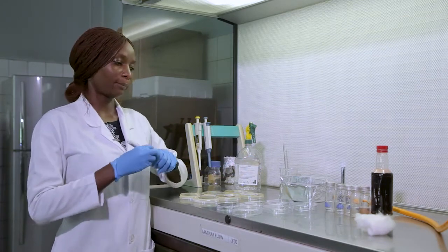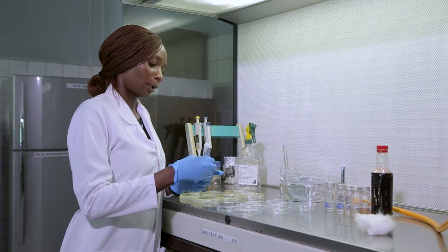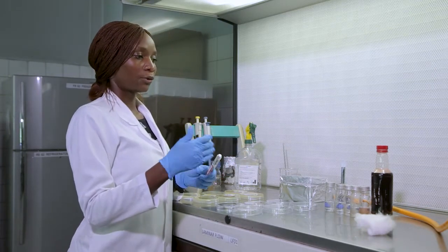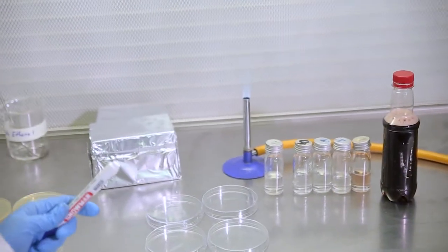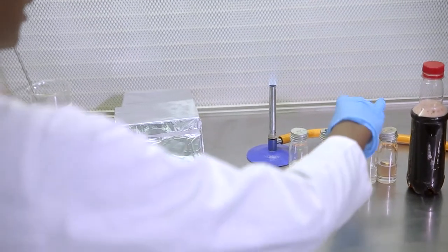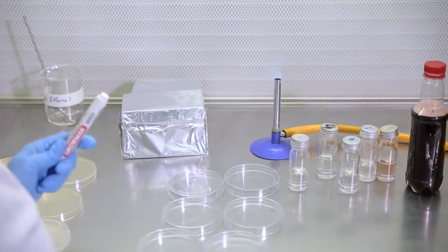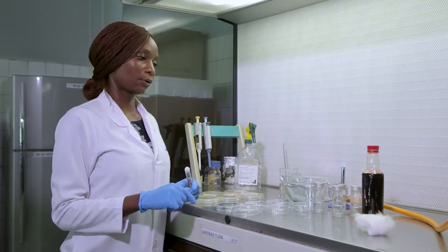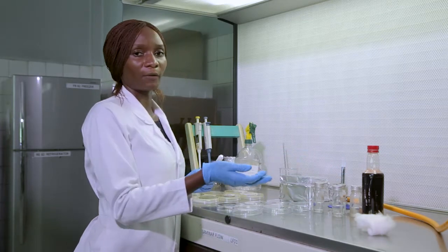You start by labeling your petri dishes, and you have to have known which 3 dilutions you're going to use. So in this case, I'm going to use the 10 to the power 0, that's the sample itself. I'm going to use the 10 to the power negative 3. I'm also going to use 10 to the power negative 5. So on the petri dishes, I have to indicate those dilutions. You, on the other hand, may decide to use any other set of dilutions.